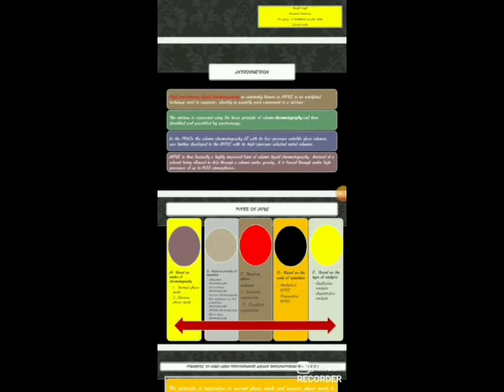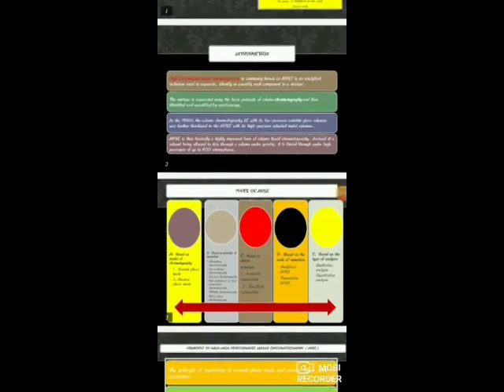Now we will heat the silica gel for 24 to 48 hours, and after that the silica is treated with organochlorosilane. Then it's converted into a non-polar phase. Basically, silica gel is responsible for polar nature, but when we use reverse phase HPLC, ODS silica gel is used.